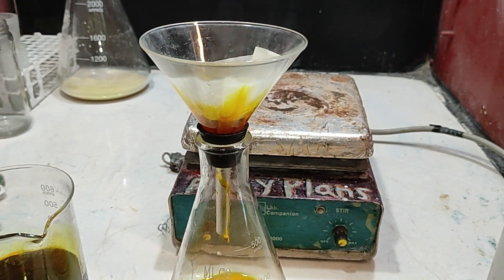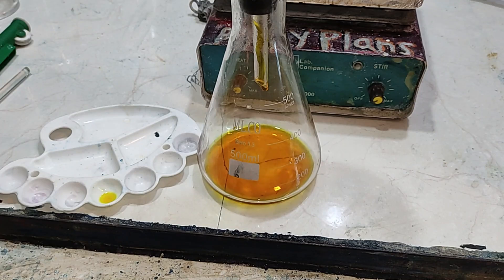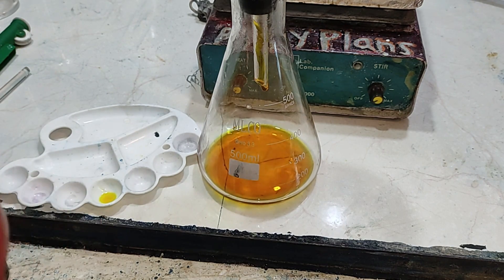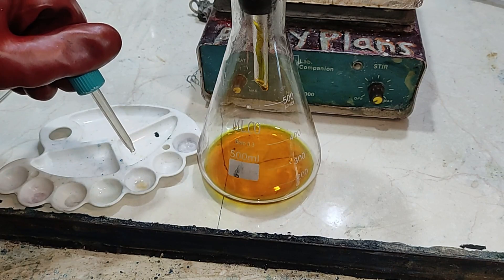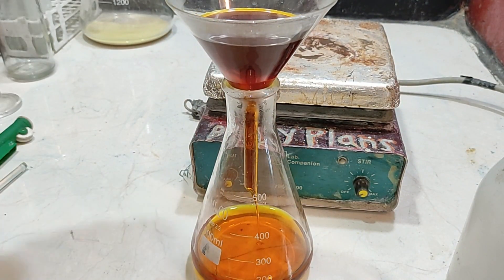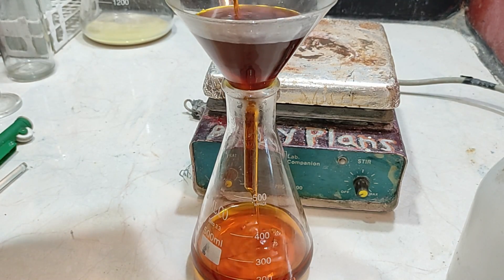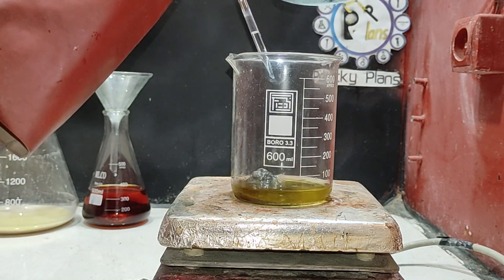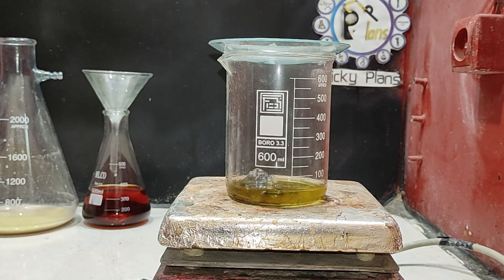To proceed further, I had to filter and wash the gold foils to eliminate iron from the solution. Additionally, the stannous test for the solution was negative — you can observe a positive test just for the control. Filtration using filter paper proved to be too slow, so I switched to cotton filtration. Subsequently, I placed the cotton piece along with the gold foils into the beaker, adding some hydrochloric acid and nitric acid to refine the gold.